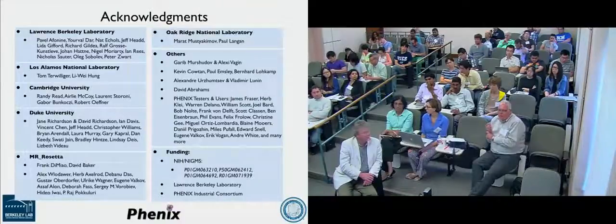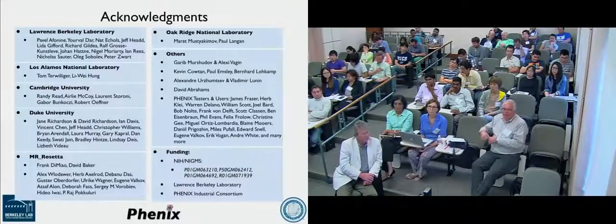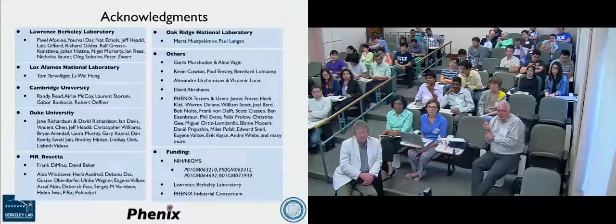But the free R was... Right, before the free R. Yeah, I'm just saying, you have examples where you apply the procedure and you calculate the free R and it's gone way up and it's kind of a whoops. No, but you pushed into a local minimum. No, I haven't seen that.